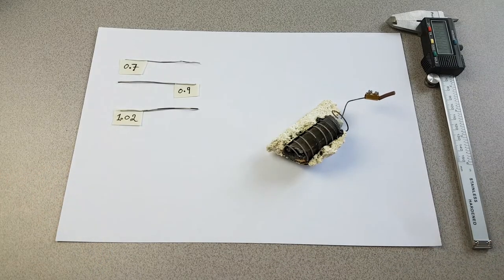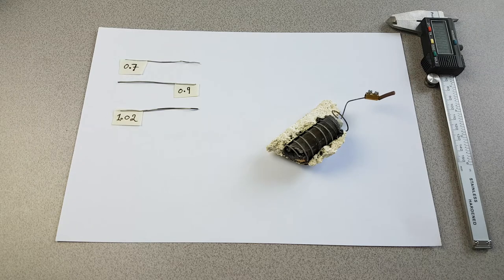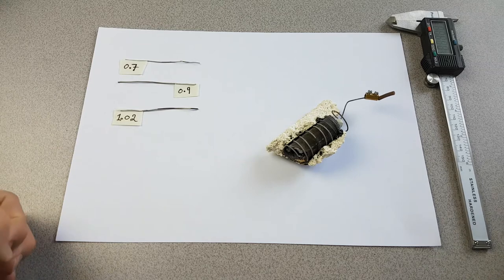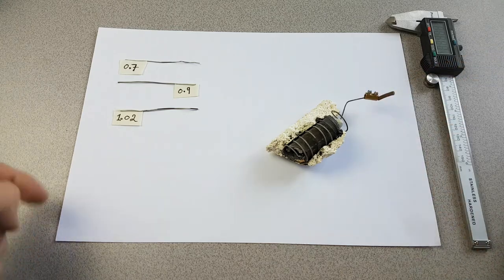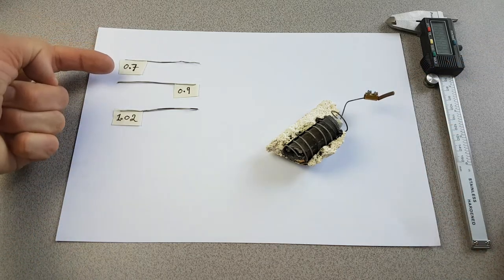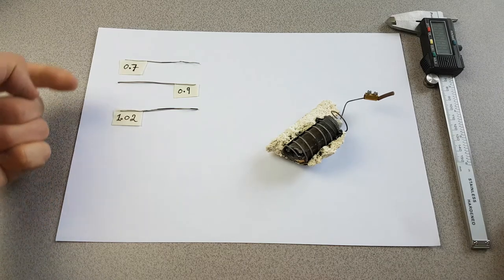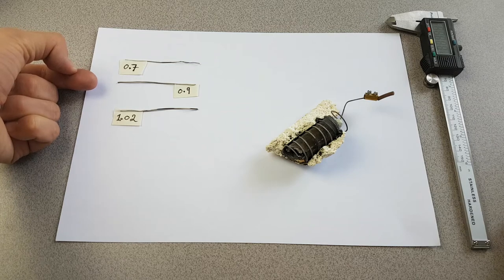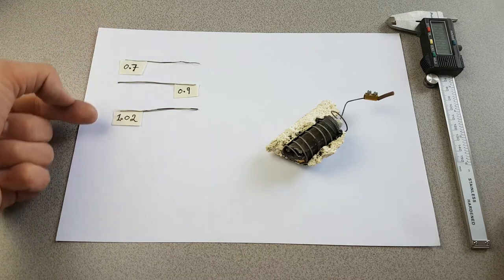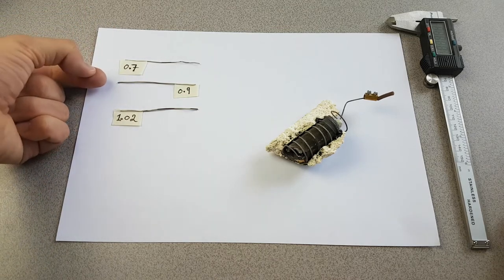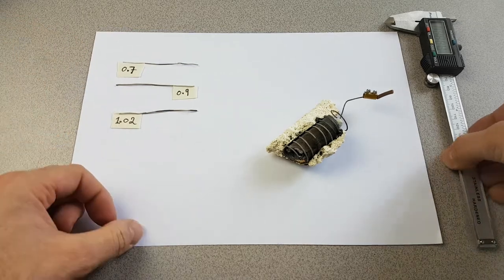To that end, when I met the Lion author in London last week, I asked him if he could send through some of the unused resistance wire that was used here. He sent through three types: 0.7, 0.9, and 1.02, with a reservation that only the 0.9 was labeled as being FECRAL. They were all purchased from Looking for Heat, but the only one that was specifically labeled was the 0.9 wire here.